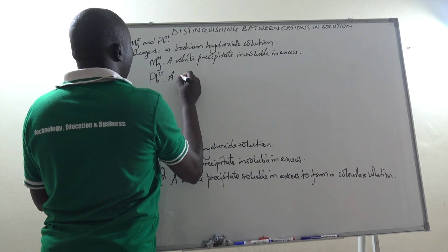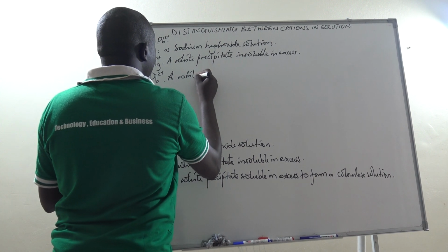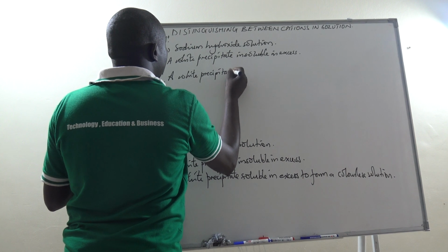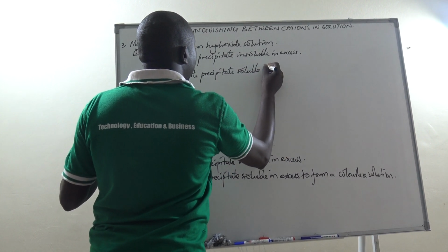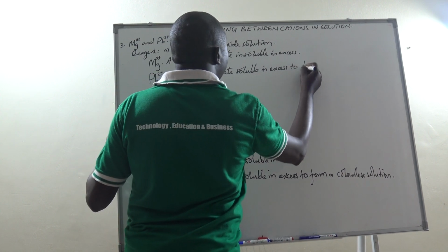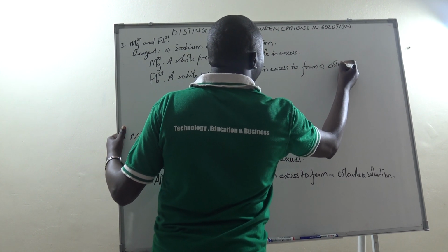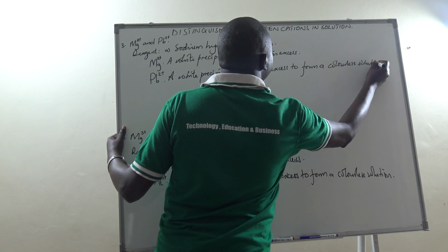forms a white precipitate soluble in excess to form a colorless solution.